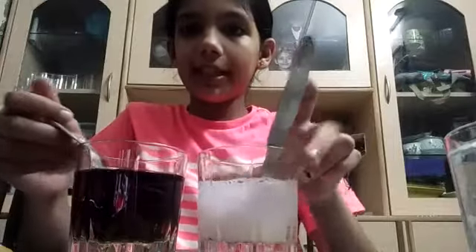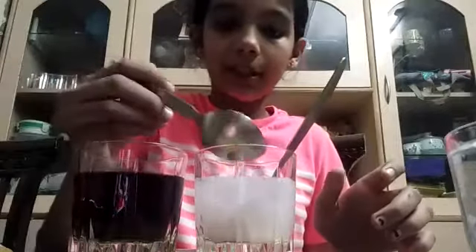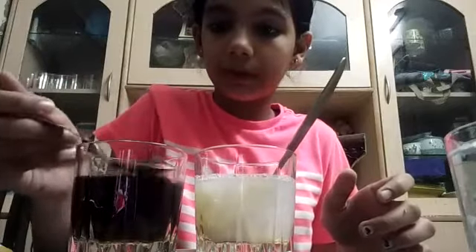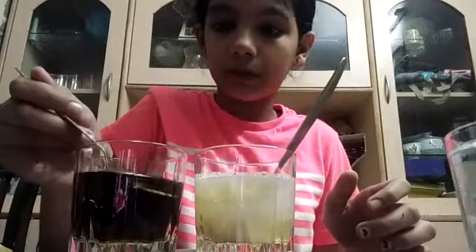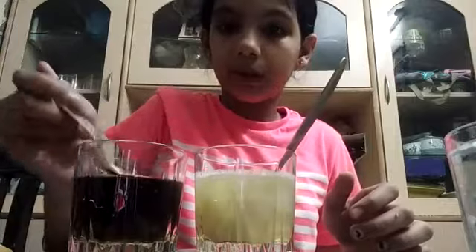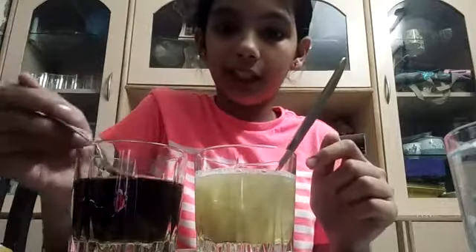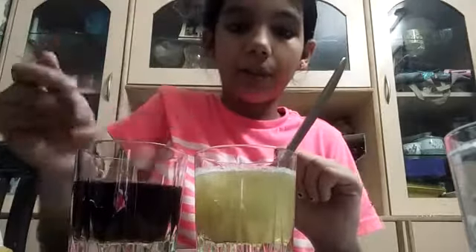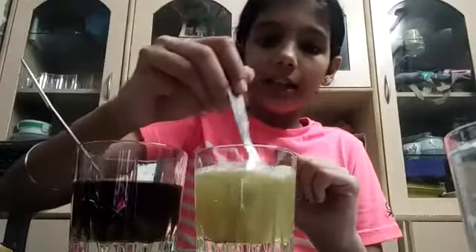And now let's try an experiment. This is a soapy solution which is a base. So now let's put it in this. And it's becoming green in color. As much as I put this into my soapy solution which is a base, it will be in green color, as you can see.